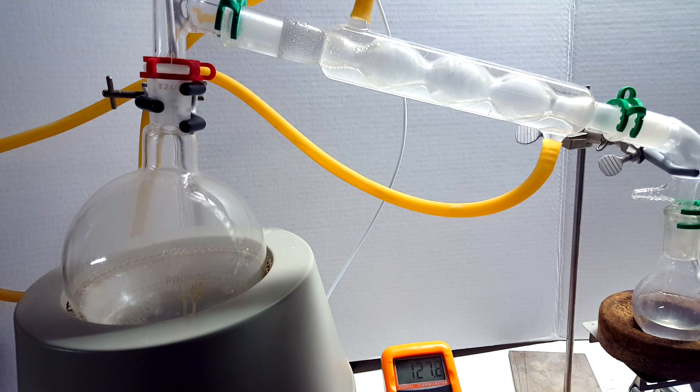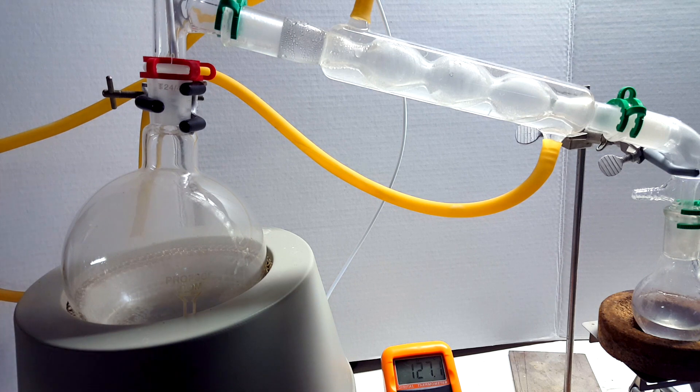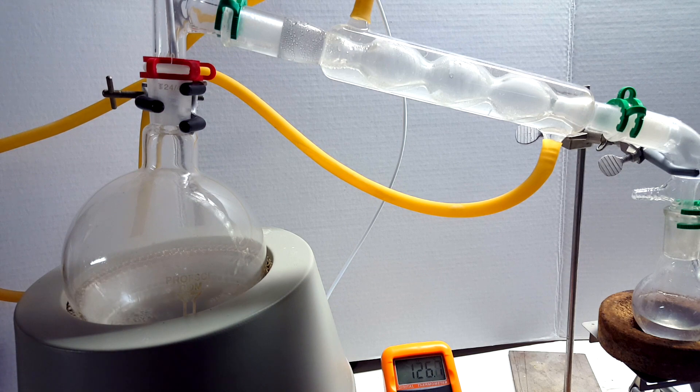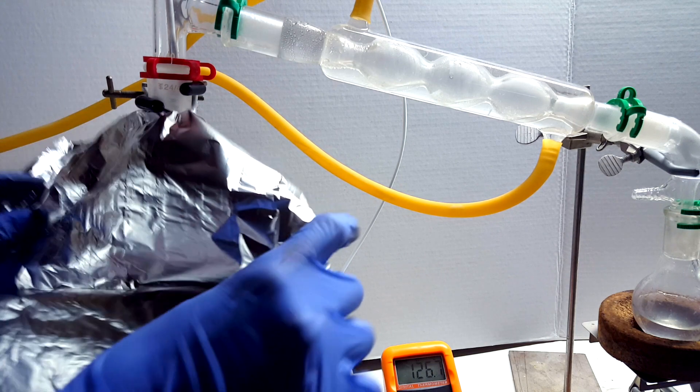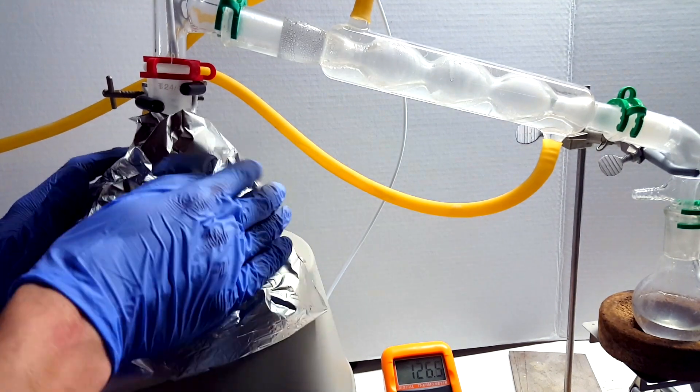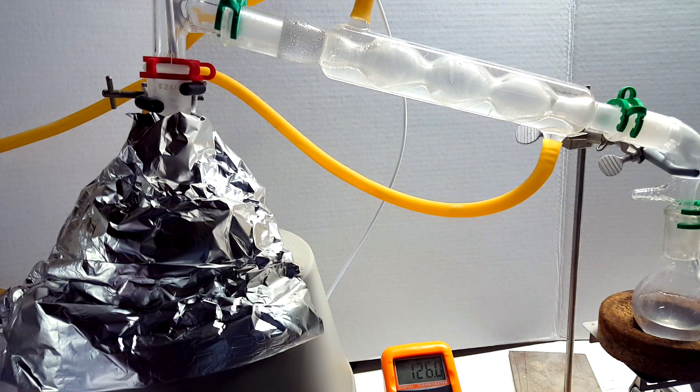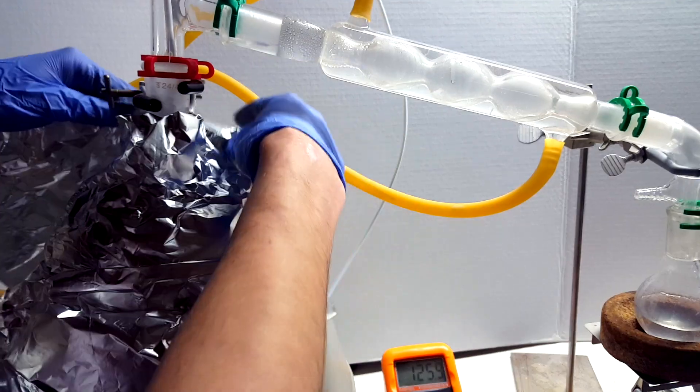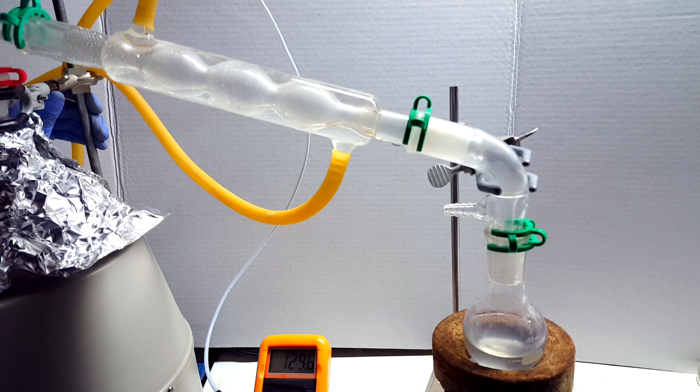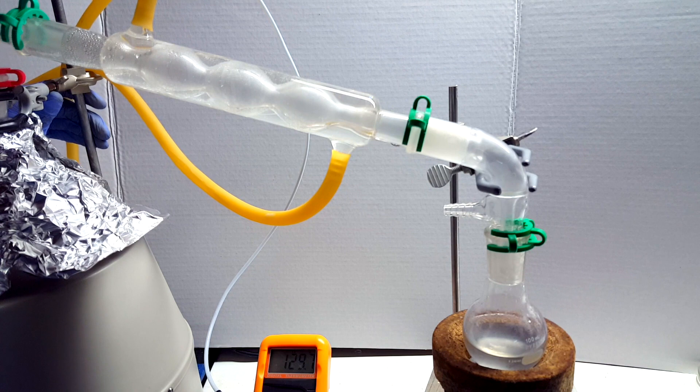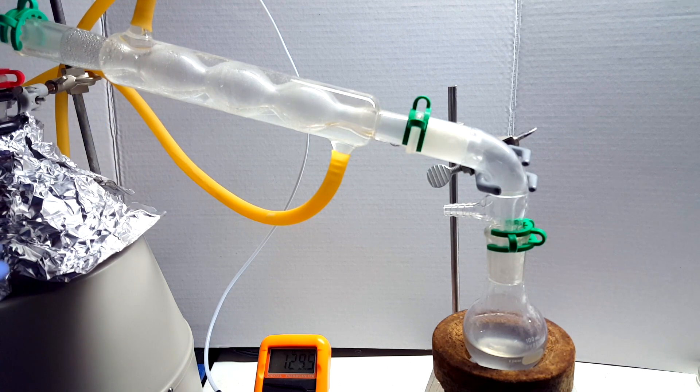The temperature then stagnated at about 127°C. This was in part due to the large volume of flask used, with only a small volume of liquid left. To insulate it some to hopefully reach the increased temperature, I wrapped the distilling flask and temperature adapter in aluminum foil. After wrapping, the temperature began to rise again slowly, and some more liquid was coming over into the condenser.